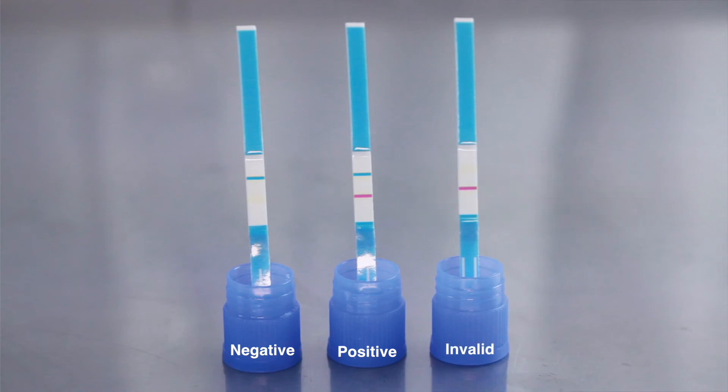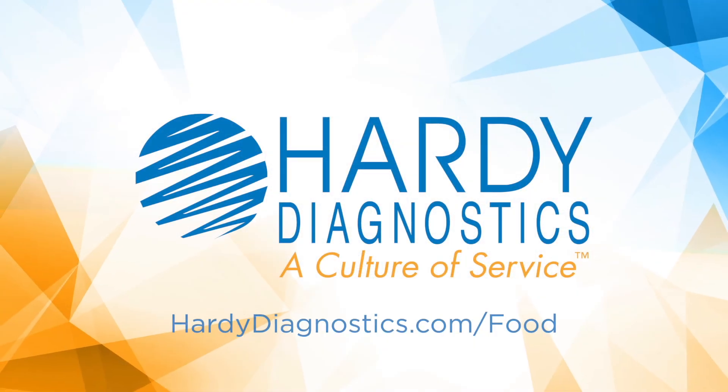When this occurs, repeat the process using a new test. This concludes the GlutenTox·Pro training video on food and drink analysis.